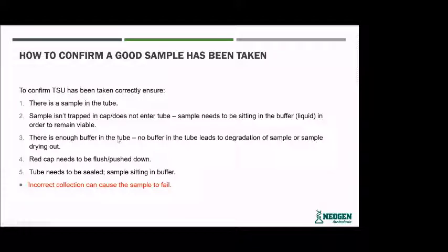Make sure there's enough buffer in the tube — no buffer leads to degradation of the sample or the sample drying out. If you don't click the applicator all the way down, the tissue tube doesn't seal and the buffer can actually leak out. Also make sure the red cap is pushed all the way down. If that's not pushed all the way in, it confirms you haven't pushed the applicator far enough down to seal the tissue within the tube.